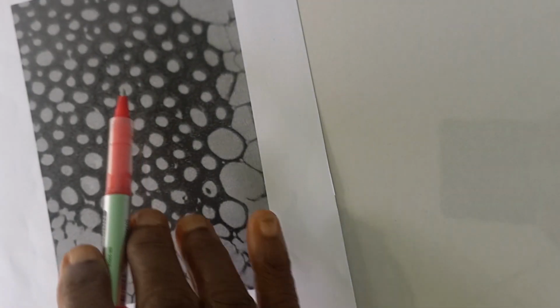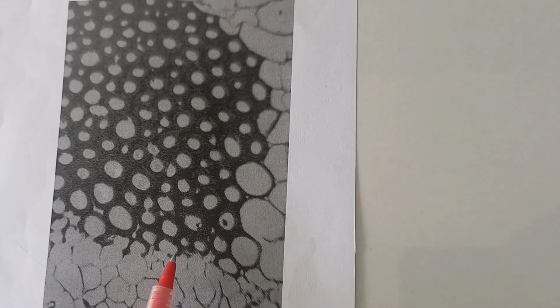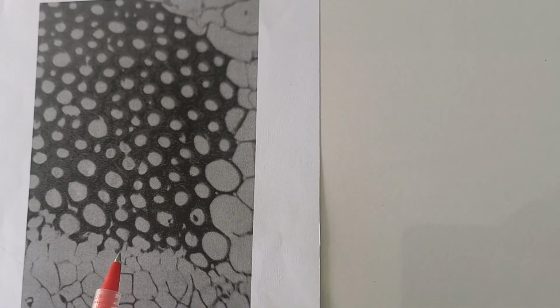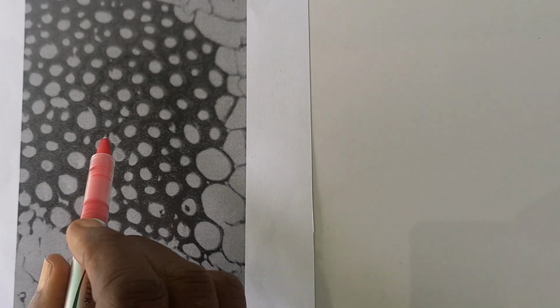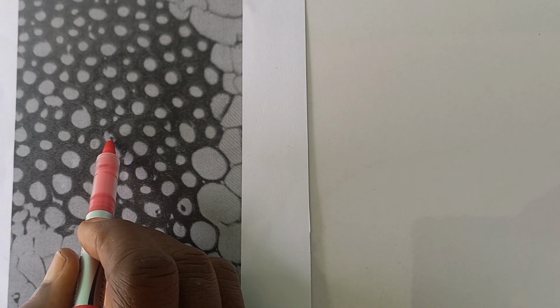Good. Now we are going to draw sclerenchyma fibers that are found in a plant section under a high power optical microscope. And here is a cell, here is the sclerenchyma. Look at this cell, which I say is A. This one is B. There's a pit here. So we chose that. So we say this is A, B. Okay, let's go here, C. Let's go here, D. Let's go here, E.